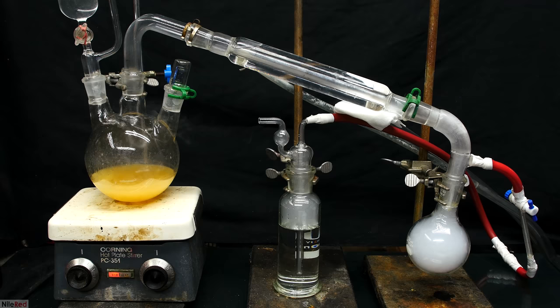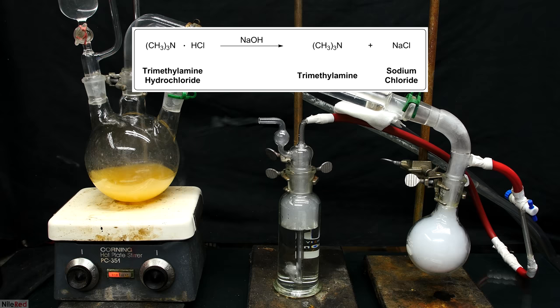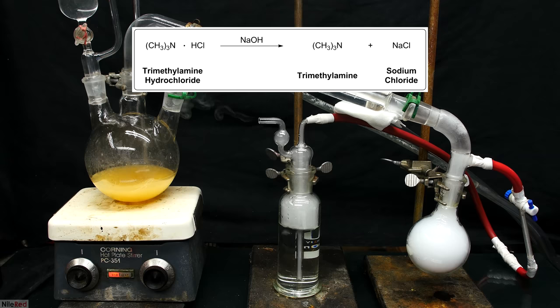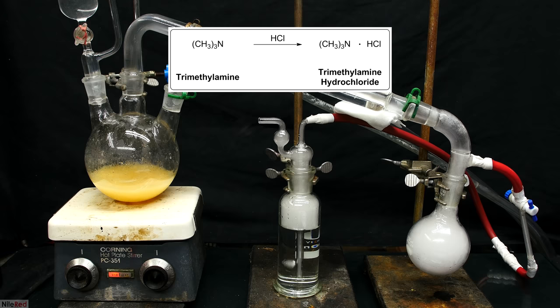In terms of reactions, what we're doing here is actually pretty simple. In the reaction flask, we have an acid-base reaction which produces our free base trimethylamine and sodium chloride salt. The trimethylamine that escapes as a gas is then bubbled through the hydrochloric acid. The reaction in the bubbler is pretty much the opposite of what we just did, and we're recreating the trimethylamine hydrochloride.